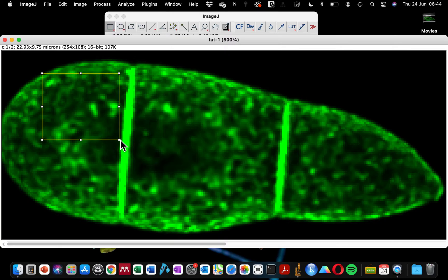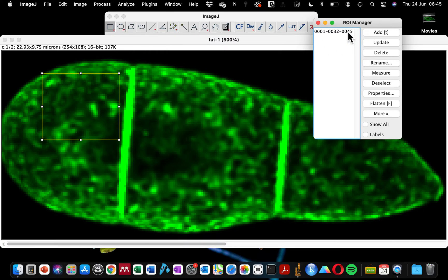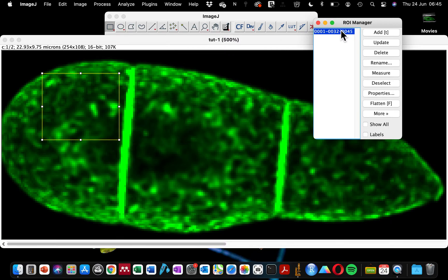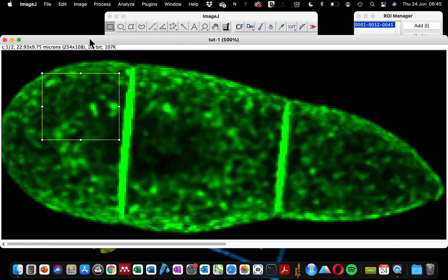For the purpose of this tutorial I will first use the rectangular tool. Let's assume we want to measure this region of our sample and you want to keep this size consistent among other areas of your analysis. After drawing this region of interest, you need to click the T button on your keyboard to add the selection to the Region of Interest Manager, so you can always go back to it to select the region you've already drawn on the image.